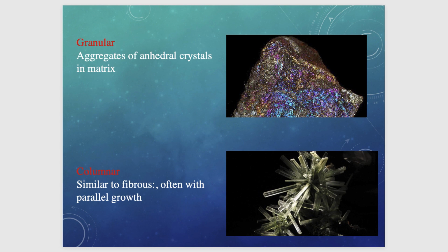Granular, as I said, is a speckly, really speckly aspect of minerals, and in this particular case you have these pinkish and bluish colors, which are iridescence colors of a metallic appearance, and these are quite commonly found in bornite. So bornite, which is essentially a copper sulfide, will be characterized by also very tiny crystals and form more massive aggregates. But since you can recognize small grains of bornite, you can call it also a granular texture.